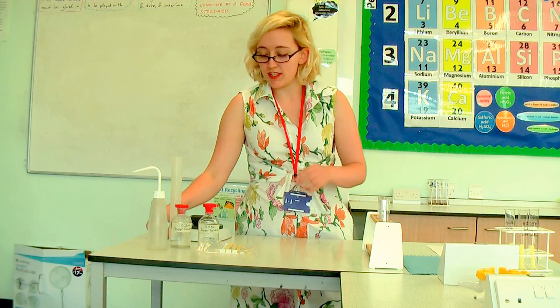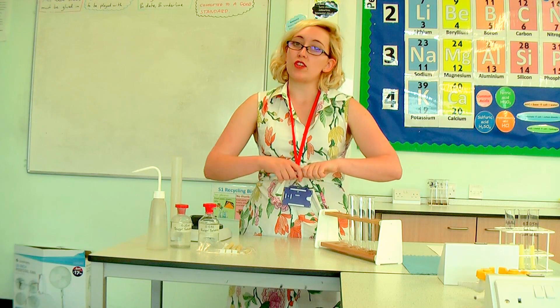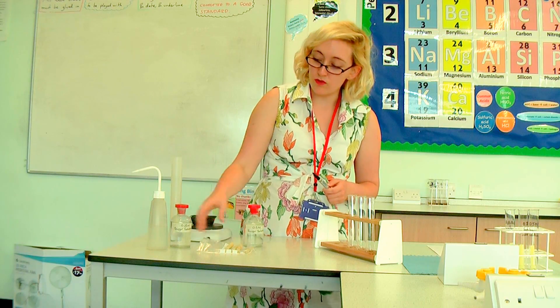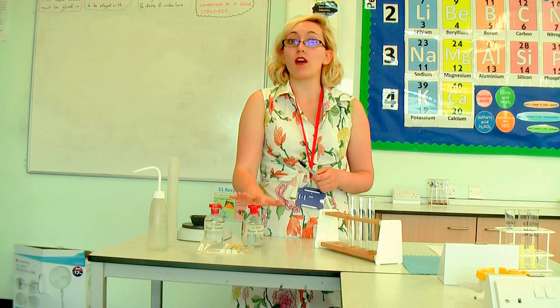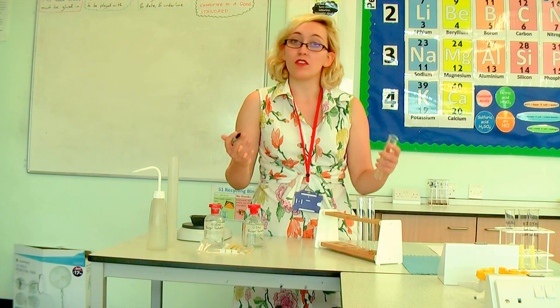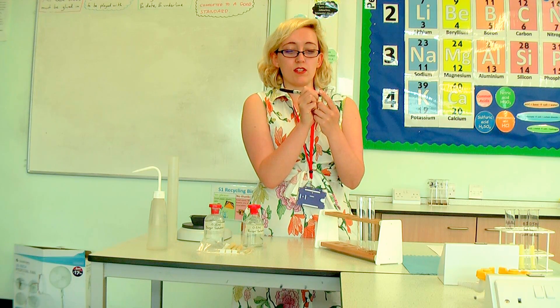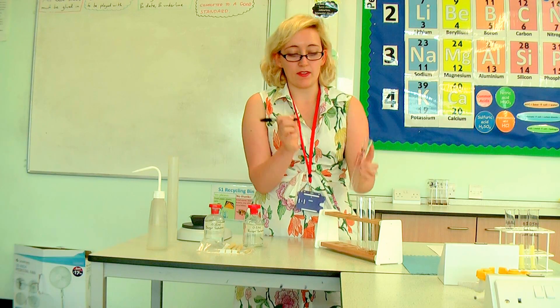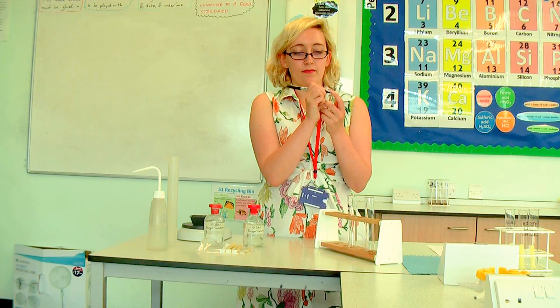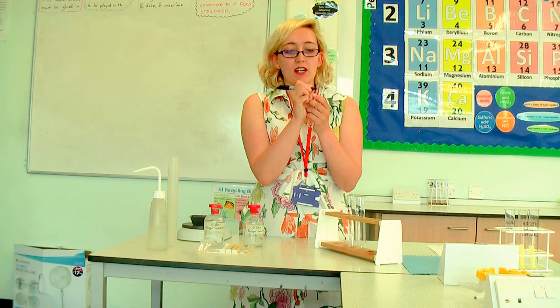Once you have the masses, we can get the next step of our practical ready, which is to sort out our boiling tubes. I've got three. I'm going to be using three concentrations of sugar solution — one of distilled water, one of 0.25 molar sugar solution, and one of 0.5 molar sugar solution. Whenever you have a boiling tube, you should always label it to make sure you know what it is later. So I'm going to label one distilled water, the next one 0.25 M sugar.